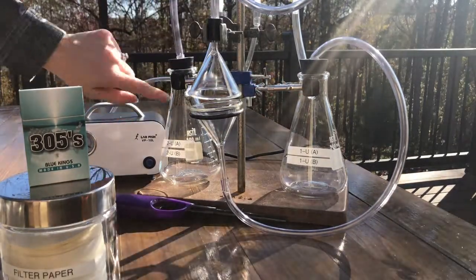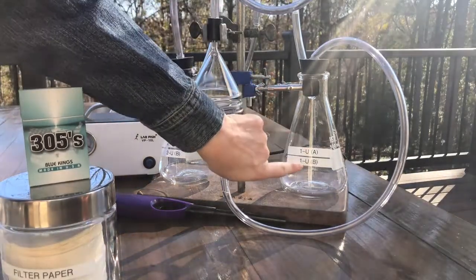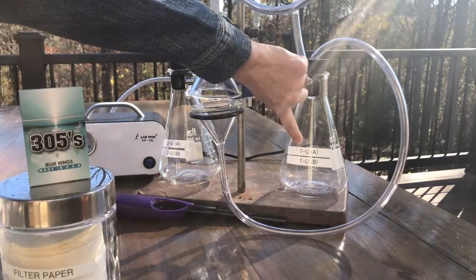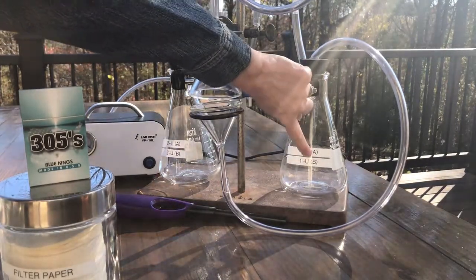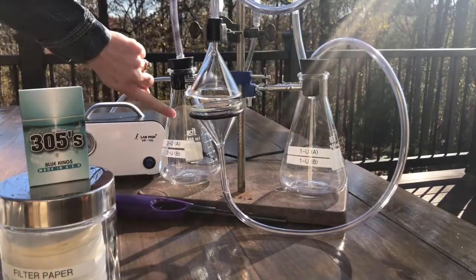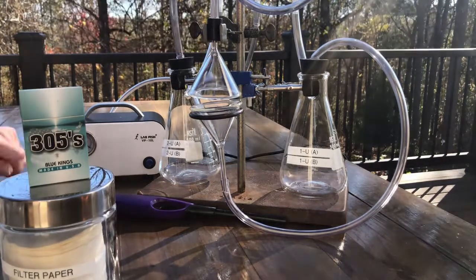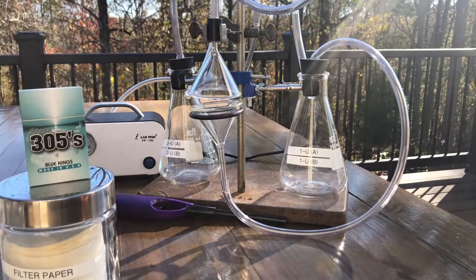We're gonna do the same thing on this side. So this one here should catch the first-hand smoke. So it's one first-hand unfiltered, trial A and trial B, because we're gonna run it twice. And this one over here should catch the second-hand smoke, because it's gonna come from up here. So I'm gonna go ahead and set all that up before I turn it on, and I'll let you see it.